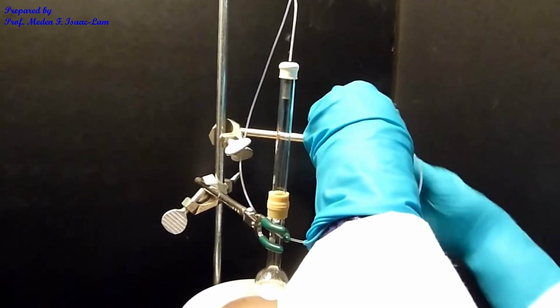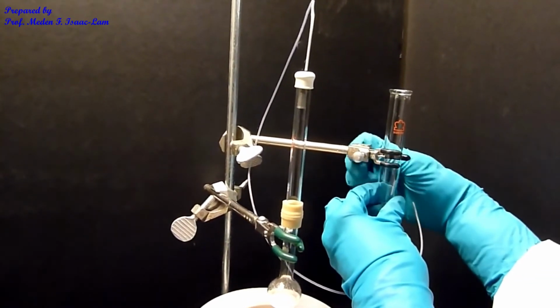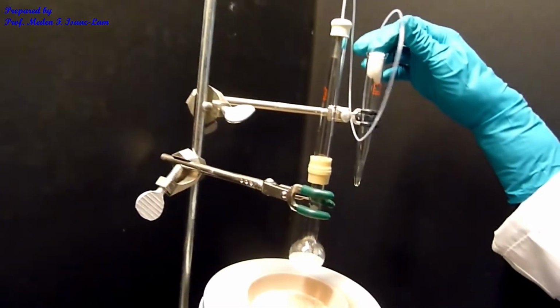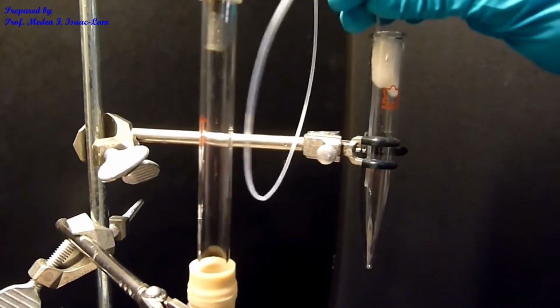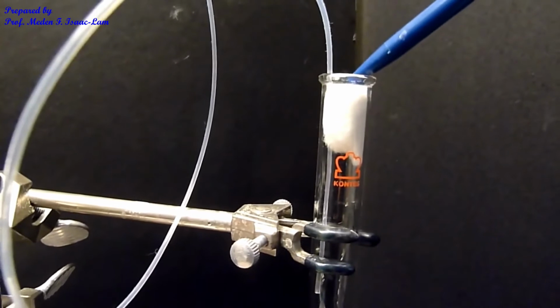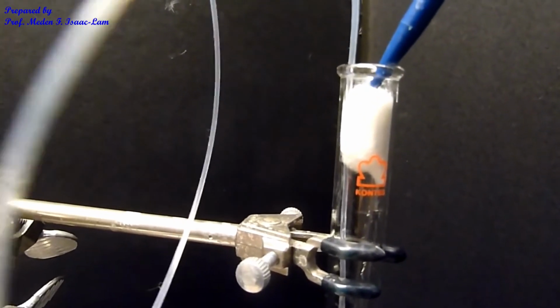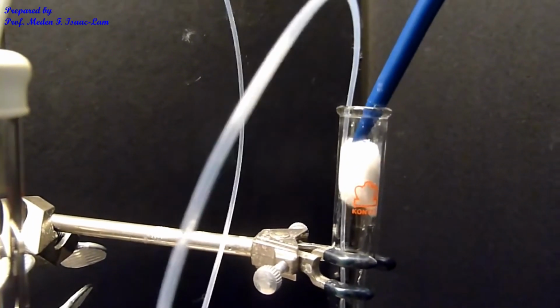So this is just the conical tube from the micro kit. And then I'm going to attach this inside, and then I have a cotton. So I'm going to moisten the cotton. So this should be below. So I will moisten the cotton with water. So this is just RO water. So I soak it so that the HBr will get absorbed into that cotton.